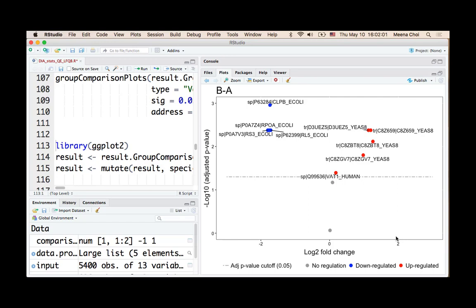And then here's the E. coli protein, also we found this is significant here. And then we also found these human proteins. Actually, it should not change, right? But based on this 0.05, we actually found a false positive, 1 false positive value. Okay?